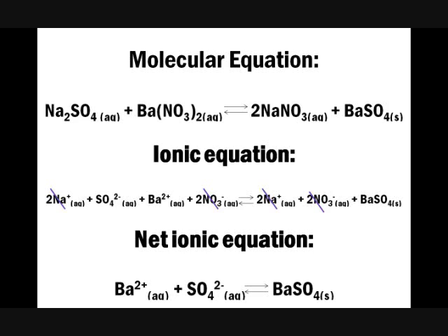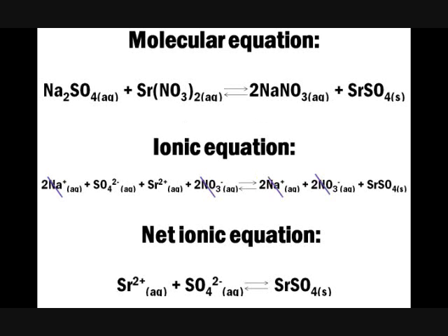This tells us that the solution formed between sodium sulfate and barium nitrate is saturated. The solubility of this substance has surpassed its maximum amount of how much substance it can dissolve. Due to this, it is unable to dissolve any more solute, and this leads to the creation of undissolved material called precipitate. A saturated solution is said to form if the dissolved substance is in equilibrium with some of the undissolved substance. Sodium sulfate and strontium nitrate react to form sodium nitrate and strontium sulfate.